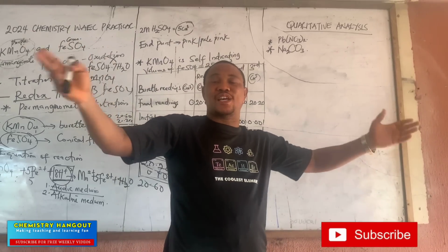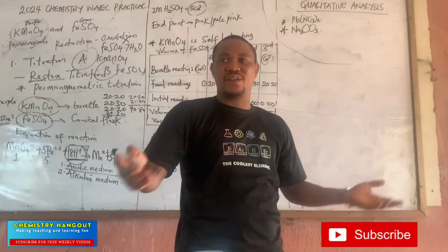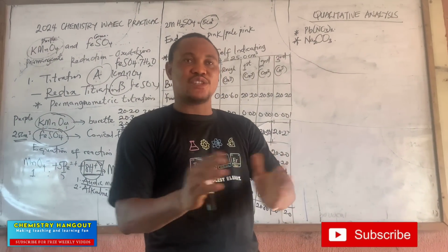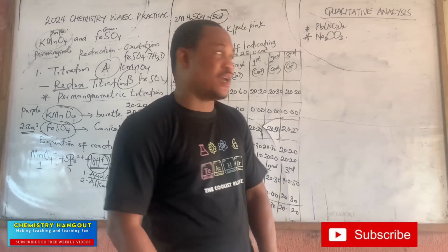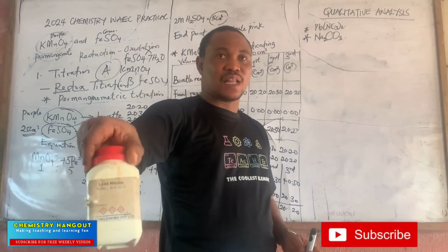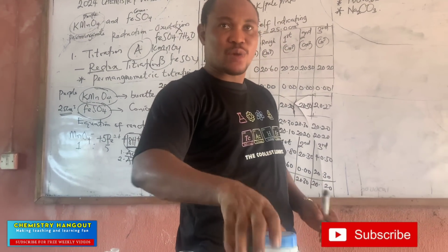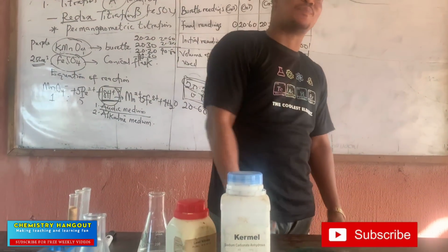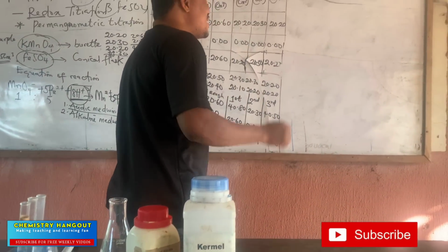Though I've not prepared my bench reagent, sodium hydroxide. I don't have any again. I would have even done the qualitative analysis, but I can't do that now because I need to prepare my sodium hydroxide, prepare ammonia, because we're going to be using them and I don't have them here. But I have my lead nitrate, definitely. This is my lead nitrate, this is my sodium carbonate. So I have the salt. They have supplied me with the salt for this. They supplied me earlier. So I expect the qualitative analysis very soon.